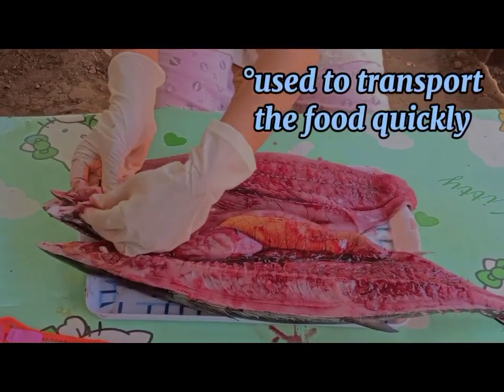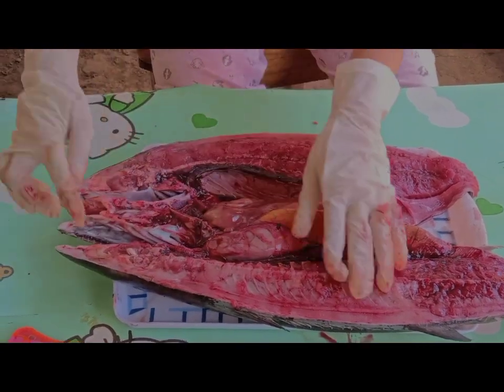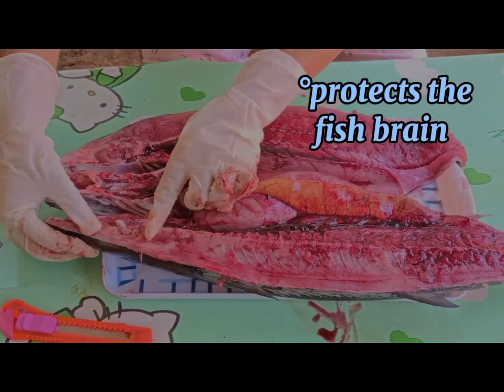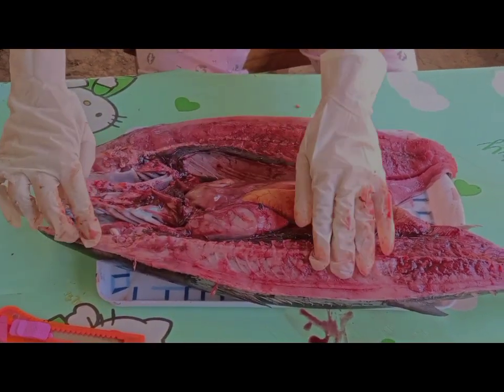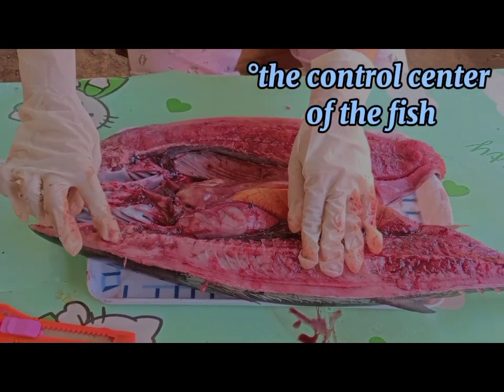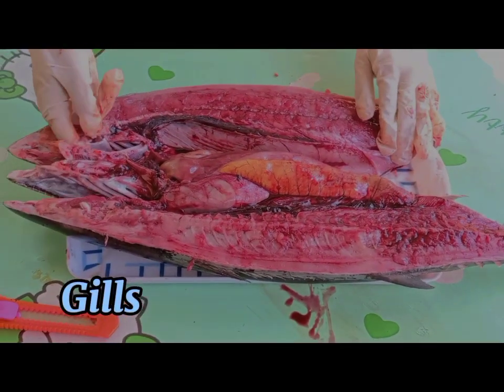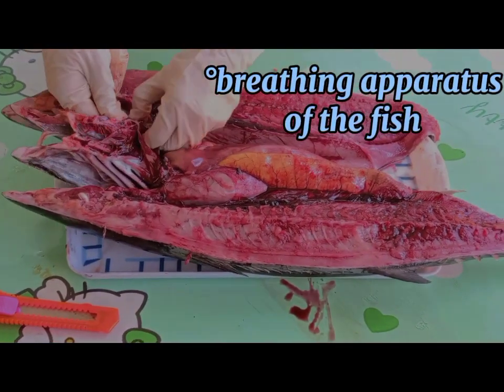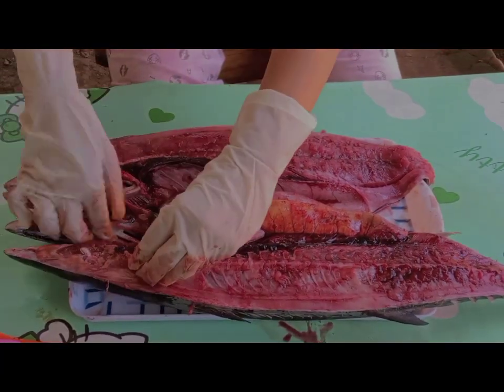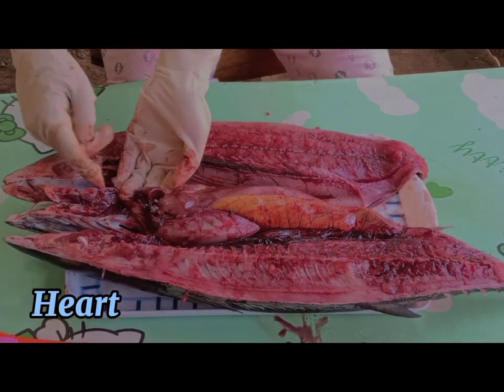This is the tongue. Next, the brain case — this is the brain case. And inside of it is the brain — this is the brain. Next, the gills — this is the gills. Next, the heart — this is the heart.